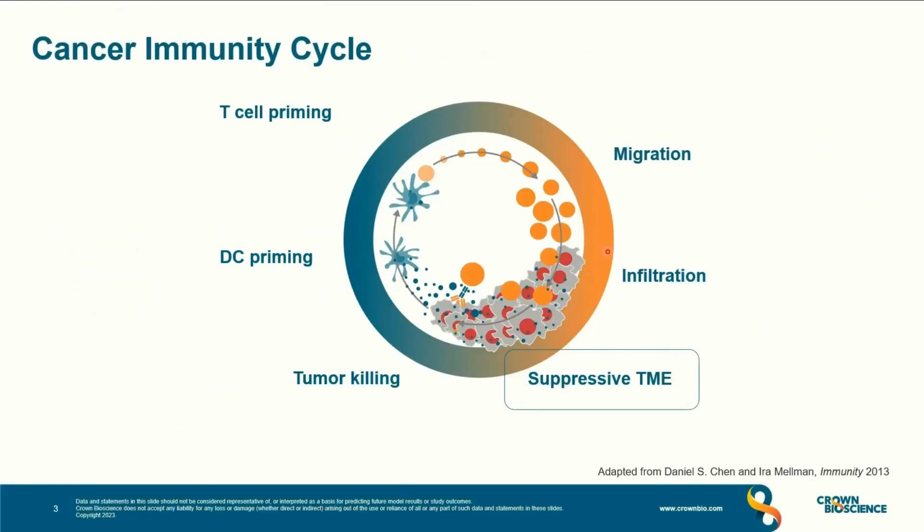If you followed our previous webinars, you are probably already familiar with this picture, recapitulating various events that happen within the cancer immunity cycle. And while my colleagues covered earlier other parts of the cycle, today we will focus specifically on the tumor microenvironment, or TME.